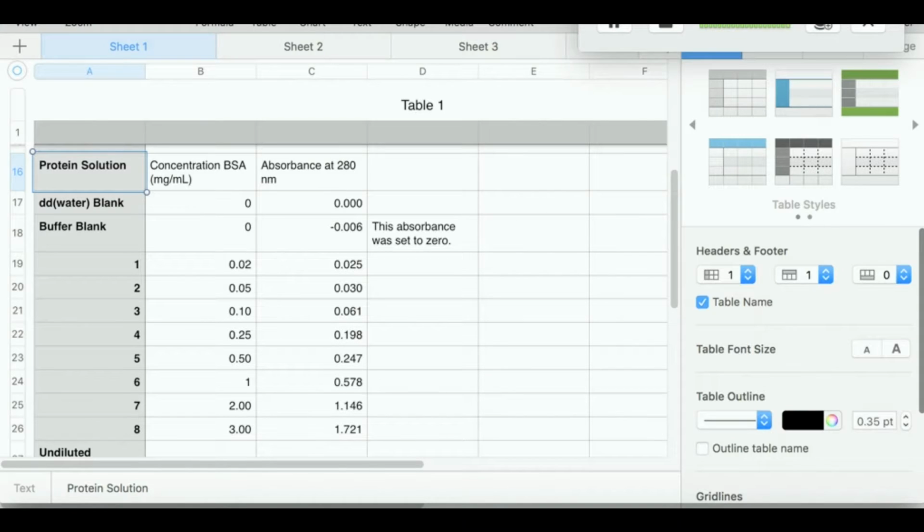So actually, once you get all the samples made, this becomes very methodical. You just put each sample in the cuvette, run the cuvette through the spec machine, measure the absorbance, all right? So I have 8 samples here. Now what I'm actually going to do is take the concentration and the absorbance and plot them against each other. So this is what I do.